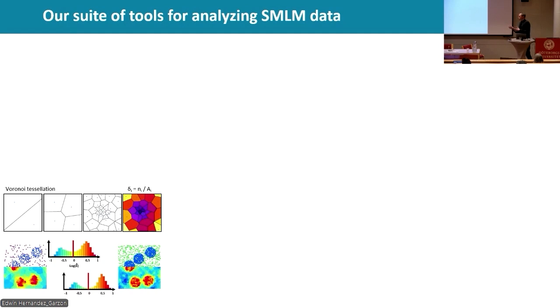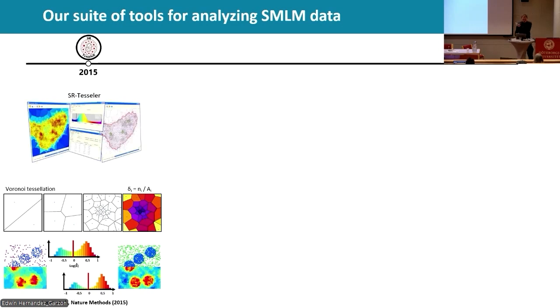And this is very important because when you are using single molecule localization microscopy, you will have very different localization densities, because there are a lot of experimental parameters. There is the fluorophore, the blinking kinetics of the fluorophore. There is the time of acquisition. There is the method. You will have more localizations with DNA-PAINT than with PALM, for instance. So being able to really analyze this with respect to the density is important, and that's what we did.